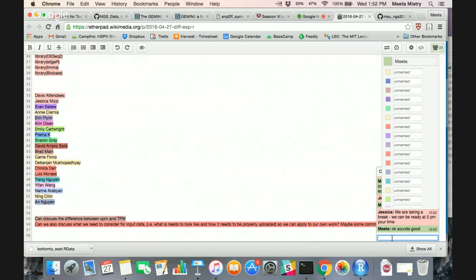No, I'm fine. That was really helpful. To follow up, one of my questions has been to understand the differences between the packages and which ones to use in different situations. These examples seem like they're giving similar results. Have you found that with your work, or I'm just curious what you've settled on?